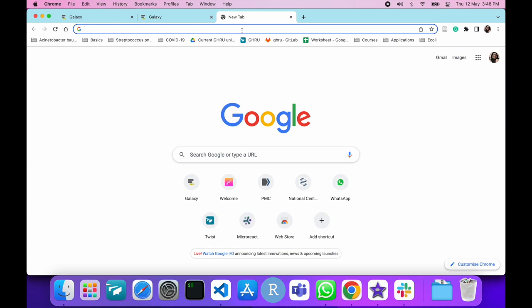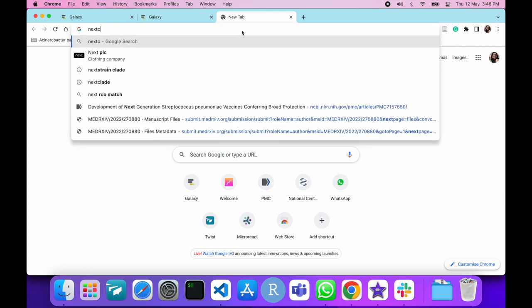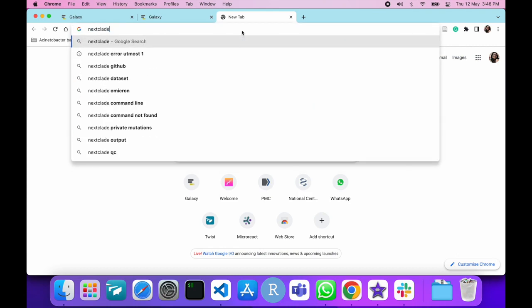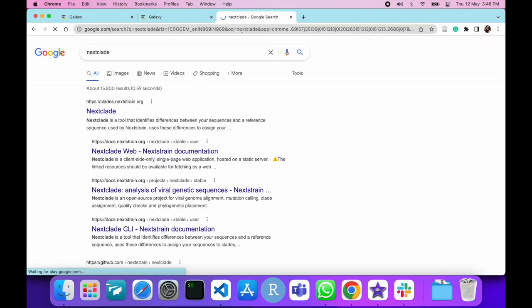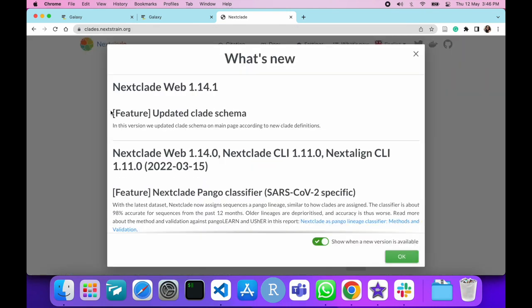Now head on to your browser and search for Nextclade. Click on the first result, clades.nextstrain.org. This will open the website.